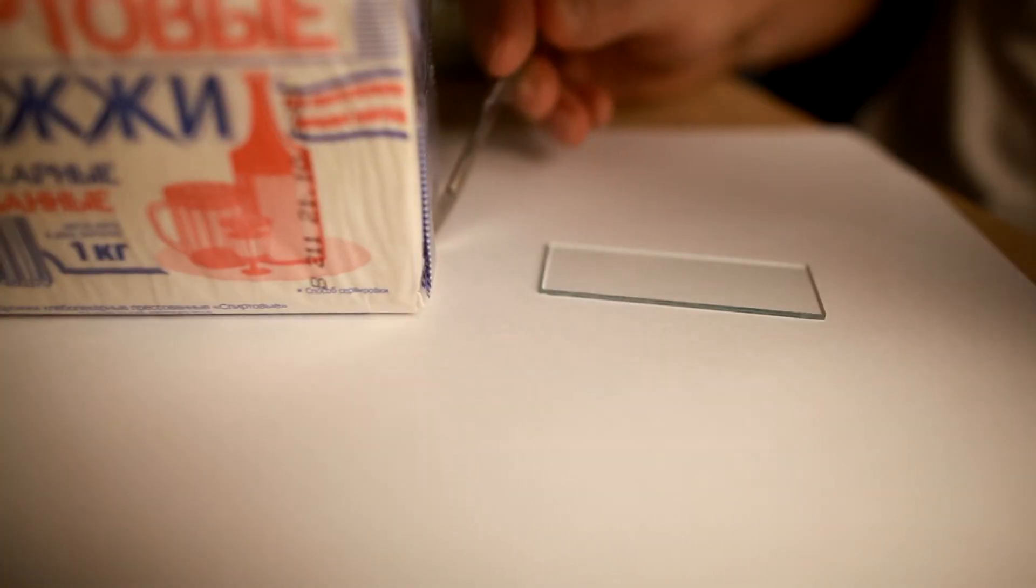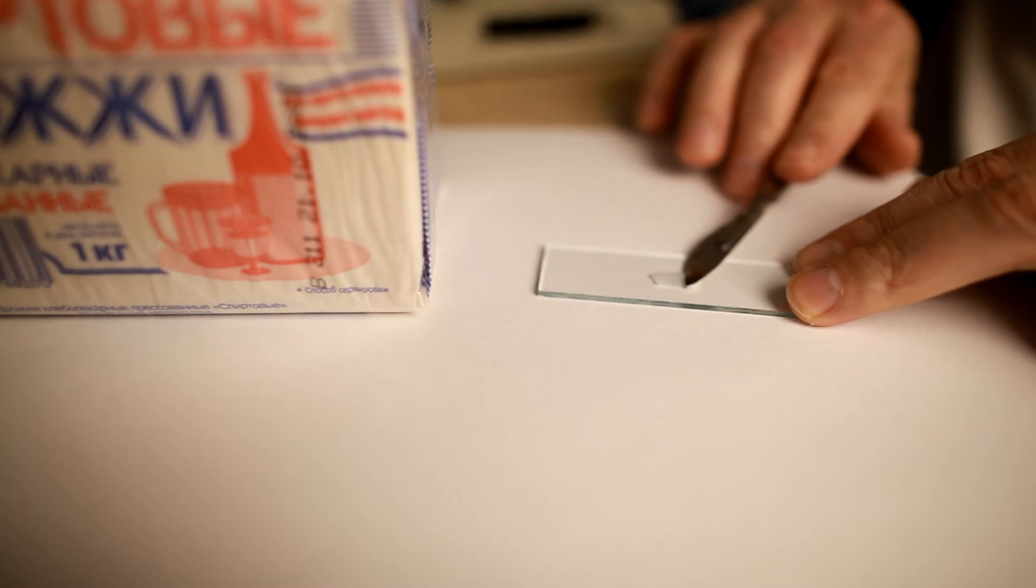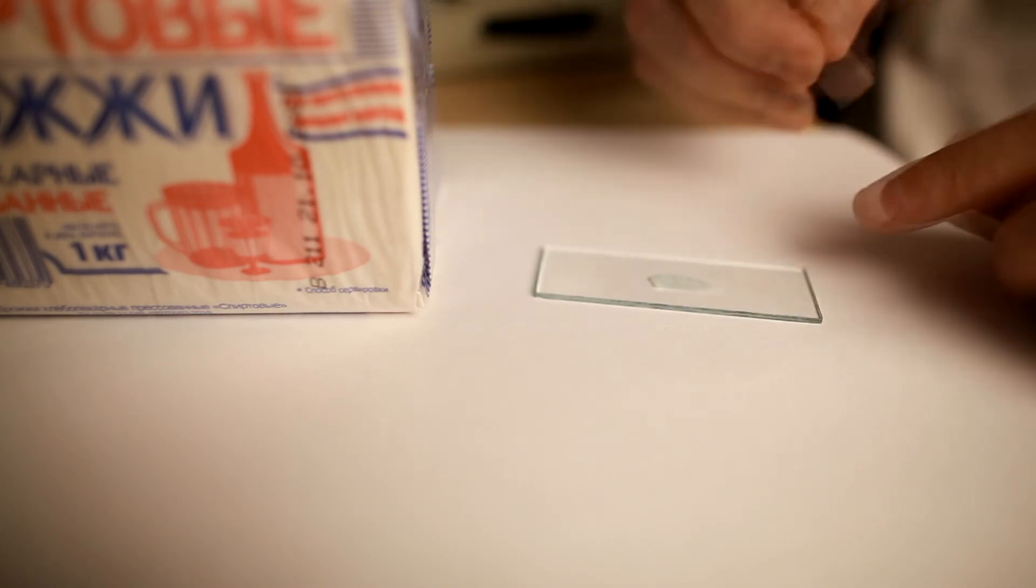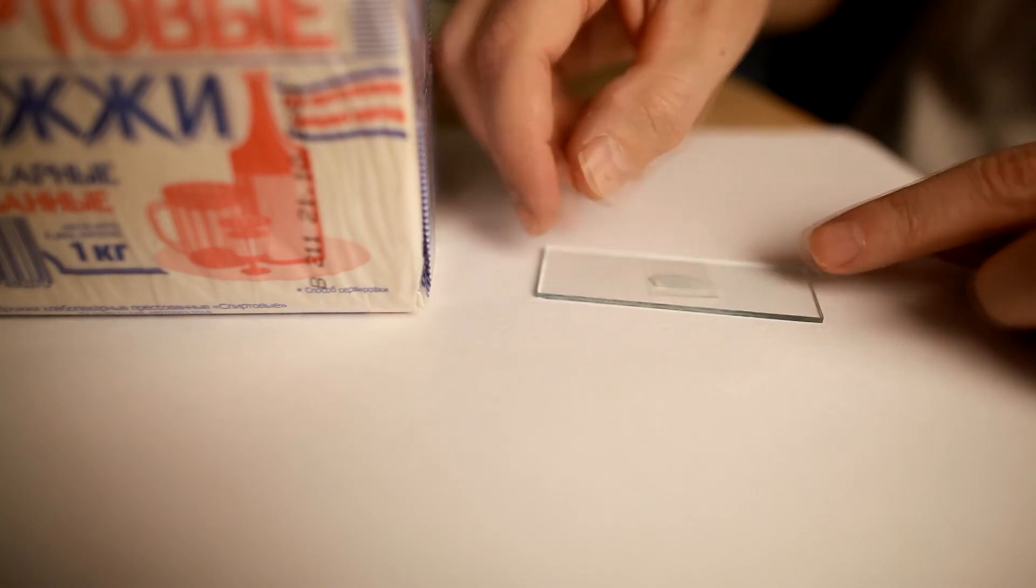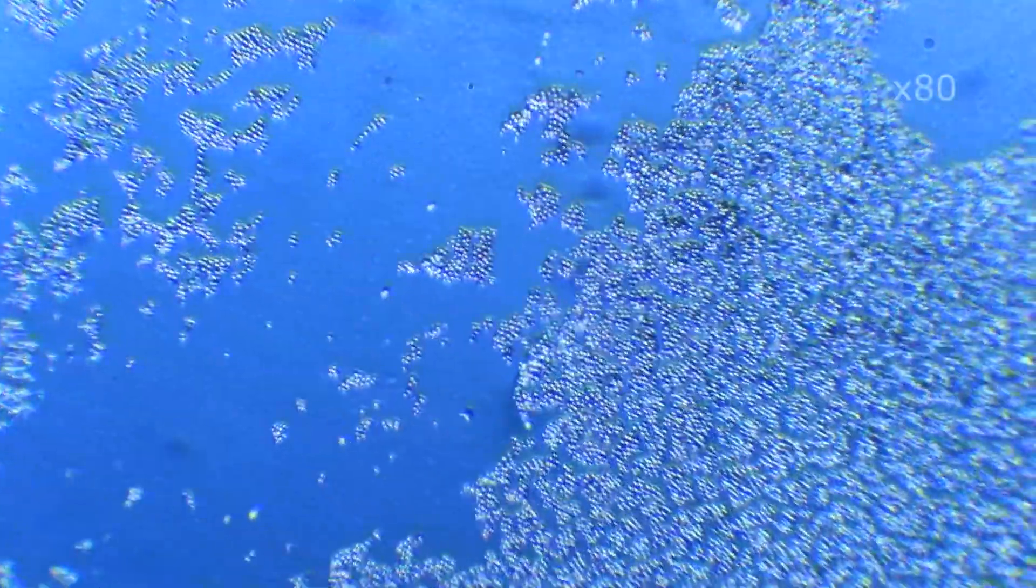We put a sample of alcoholic yeast on the glass and see that the yeast consists of cells.